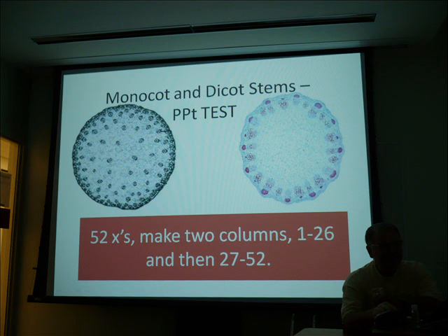Which one has a pith, and which can't have a pith? There's your pith, because you form a ring that encircles it. You see a ring over here? No pith over here. It's all parenchyma. If I had a ring, I could say there's a pith inside it. Usually this decays away. You ever see a tree whose inside is rotting away? When that tree falls over, it's hollow inside. This is what hollows it out. As it grows, new rings are laid down, and if you count 5 rings, it's 5 years old. No rings: this one grows tall. It can't grow out. This one grows out and up. The oak trees are like this. But this would be a little baby oak.